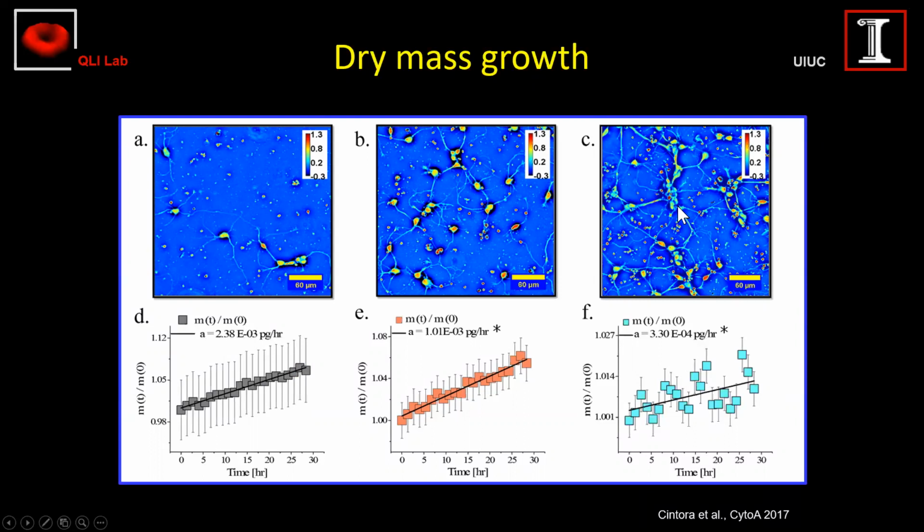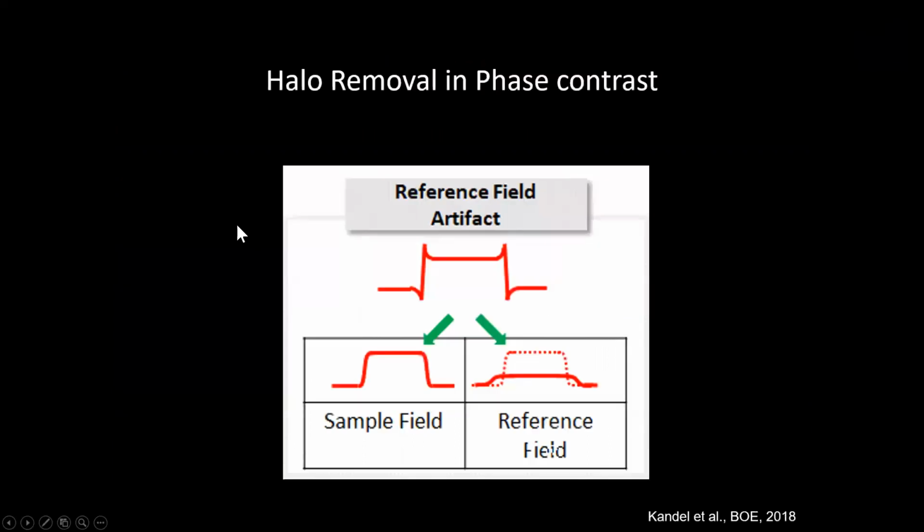They're already connected. They spend a lot of their energy actually exchanging information, because we can understand also the mass transport between these nuclei, between these neurons. So anyway, I think this is the first time that something like this can be done to really monitor a neural network as it grows over many days without killing it, without toxicity, without affecting its function too much.